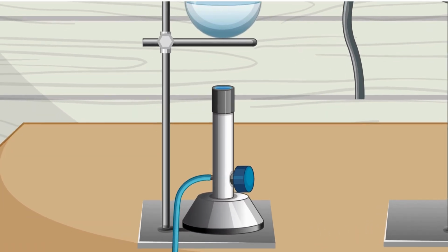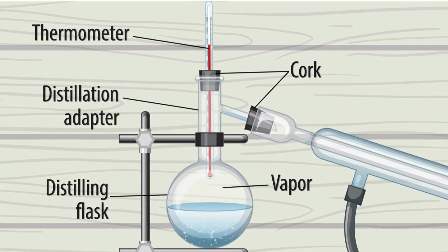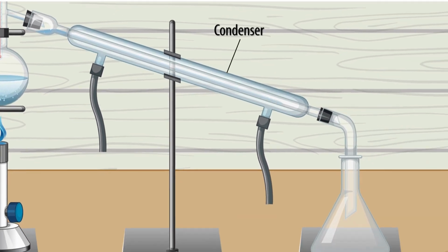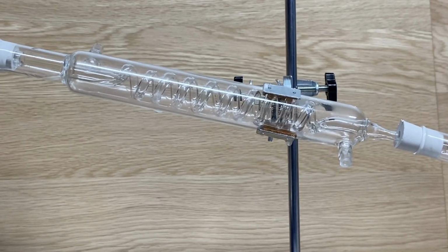So, what are we doing here exactly? Well, we put the alcohol in a round bottom flask and we start to heat it to that boiling point. As you can see, there is also a thermometer present to make sure we know when to stop boiling the alcohol or the mixture in the round bottom flask. Alcohol boils at normal pressure around 79 degrees Celsius. So, as long as the temperature is showing around 80 degrees Celsius, we are vaporizing the alcohol. However, if the temperature starts rising quickly, we can be sure that we now have reached a point where all the alcohol is mostly gone and we will start to vaporize the water and other molecules that basically stayed in the round bottom flask. Since we are only interested in the alcohol, that is the moment we will turn down the heat.